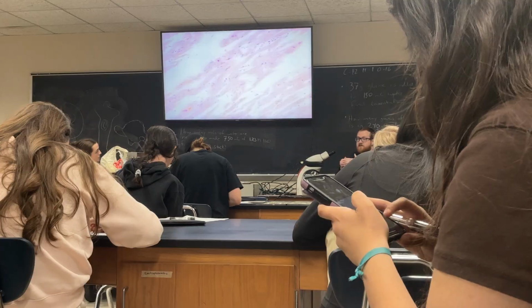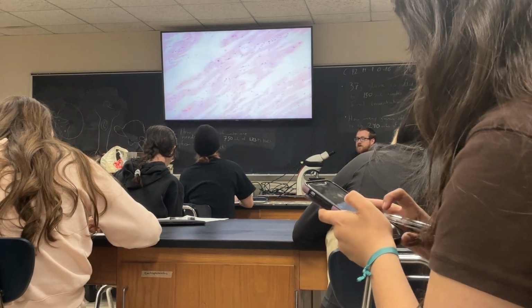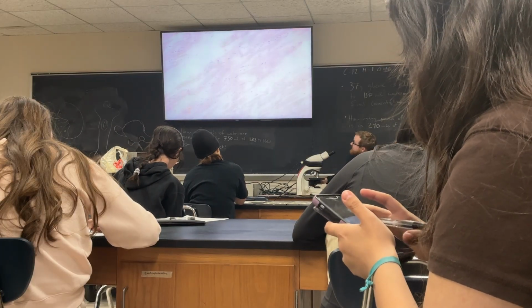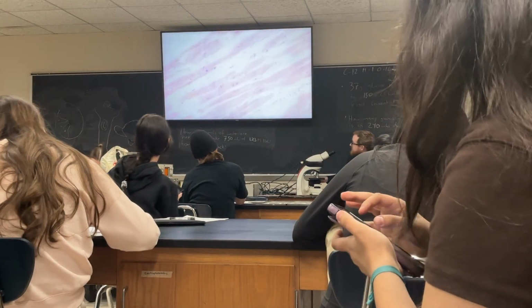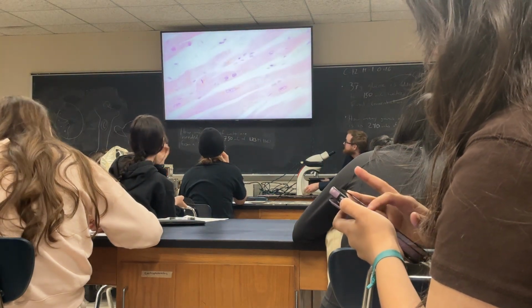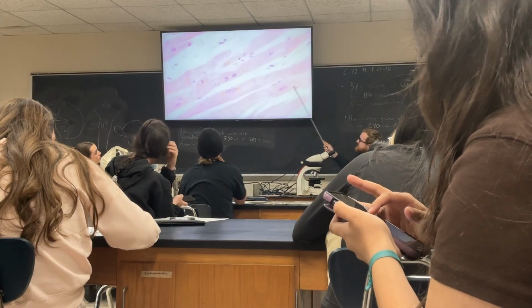You'll find intercalated discs. I'll try to do that for the actual test. I'll try to find some more in a second. Ideally, I would have those in the view during the test so that you would have that context. But I'm going to show you why you don't need that context because I don't see any intercalated discs here. And the reason why I still am confident that this is cardiac muscle is because these nuclei are in the middle of that cell, right?